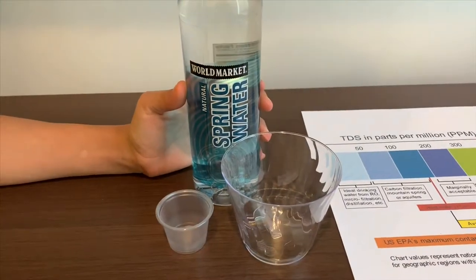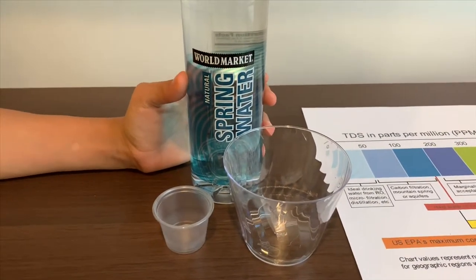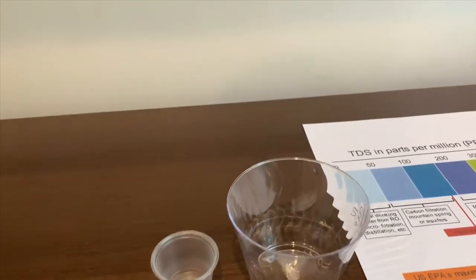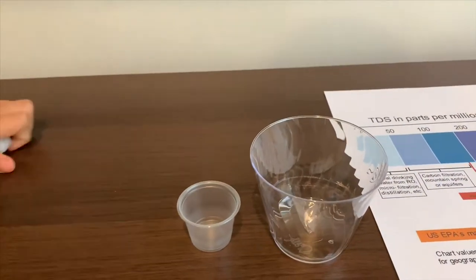This is natural spring water from Wisconsin, sold at World Market. Let's pour some water in and test the TDS level and the pH.